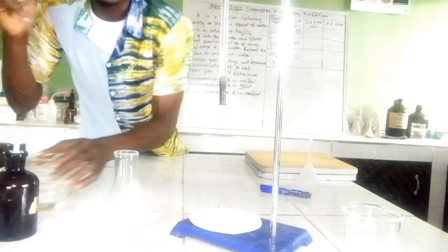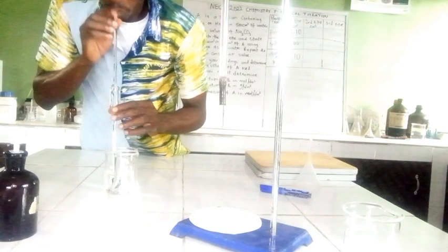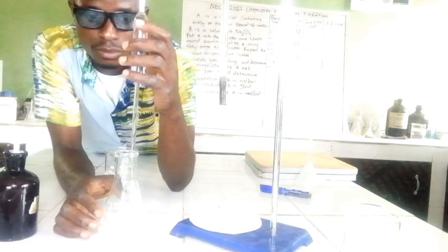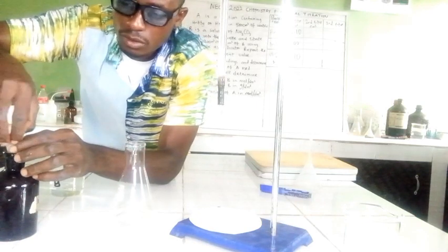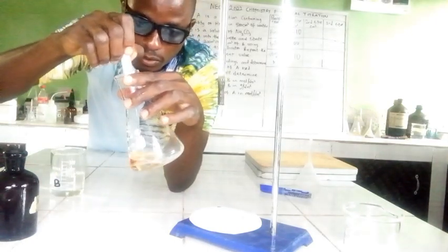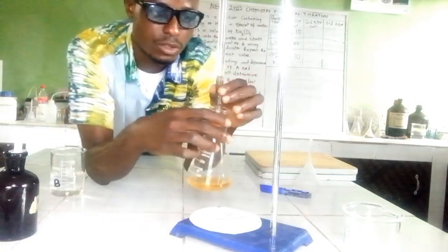So this is my solution B. Let me pipette again. Okay. Now we go for the second titration. Sorry, I didn't put my indicator. Forgot to do that. So then let's add it. So now I've gotten this. So now let's move on.